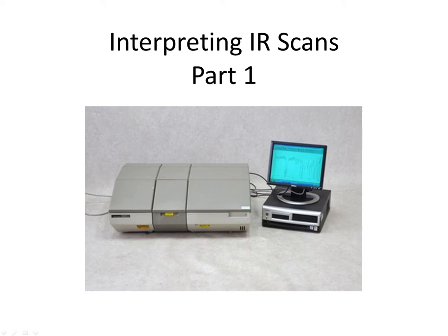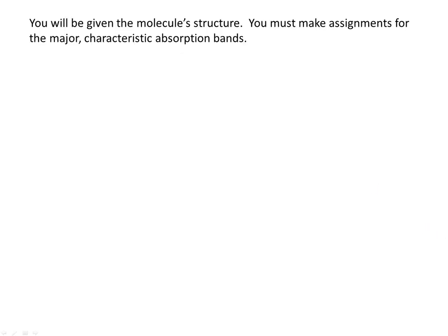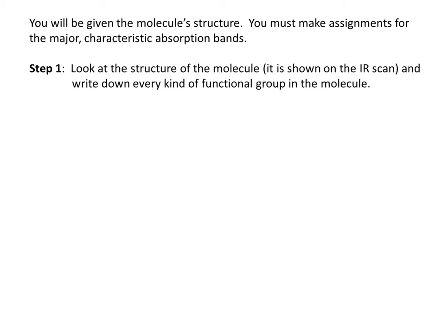In this lesson, I'm going to explain how to interpret infrared scans. You'll be given the molecule structure. That's not something that you have to figure out. You'll know it. You must make assignments for the major characteristic absorption bands. There's 4 steps to follow.